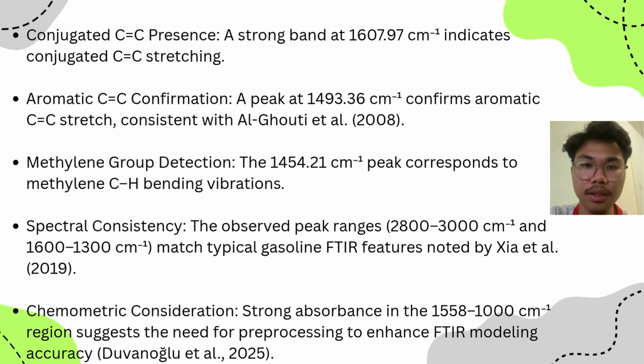This observation is in agreement with Al-Gauti et al. 2008, who reported a similar peak at 1497 for aromatic structure. In addition, the 1454.21 peak corresponds to the methylene CH2 bending vibration, supporting the presence of the aliphatic component in the fuel mixture.